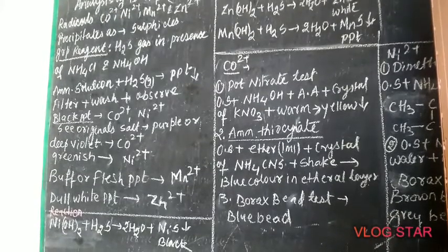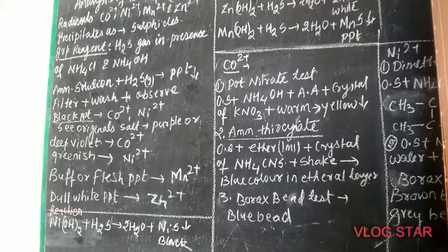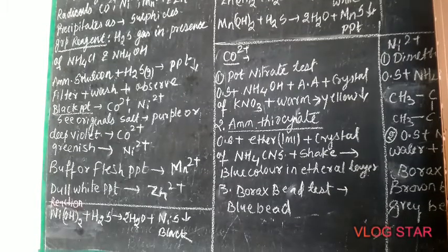Reaction: Ni(OH)2, that is nickel hydroxide, that we get from the ammonical solution. Already we have the ammonical solution from there.